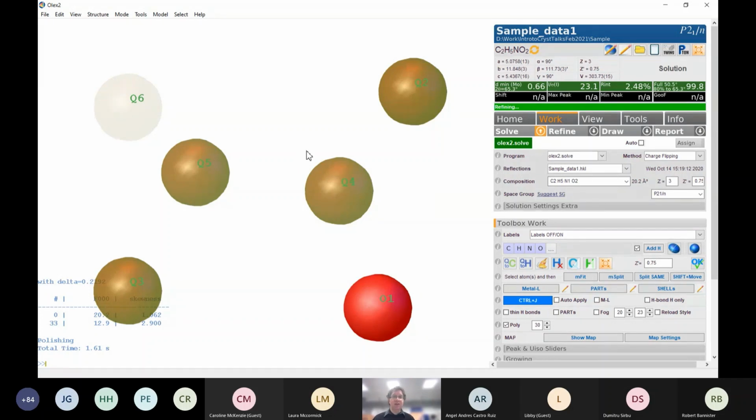My initial approximation is, as we've got 2 oxygens, Q2 will be another oxygen. Might be wrong, but then the next thing down, Q3, will be a nitrogen. And if we're doing it correctly, the next 2, so Q4 will be a carbon and Q5 will be a carbon.